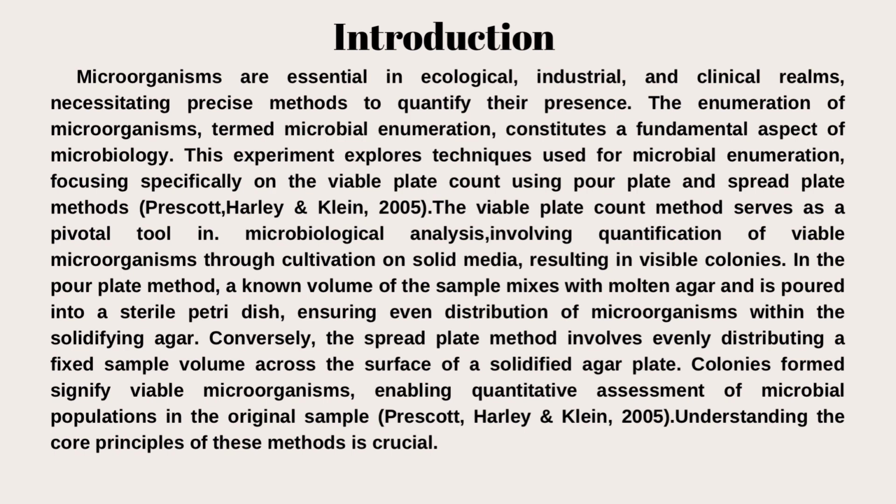methods. The viable plate count method serves as a pivotal tool in microbiological analysis, involving quantification of viable microorganisms through cultivation on solid media, resulting in visible colonies.